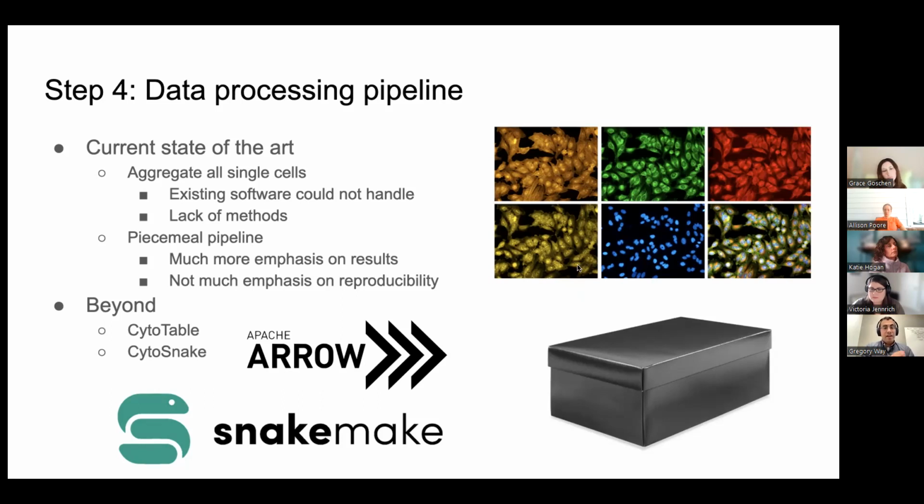That is essentially ignoring all of the single cell information. You still apply the segmentation and you still extract features per single cell, but it's really washing away a lot of information. And the Way lab here thinks that you're washing away so much information, why not use the single cell data?